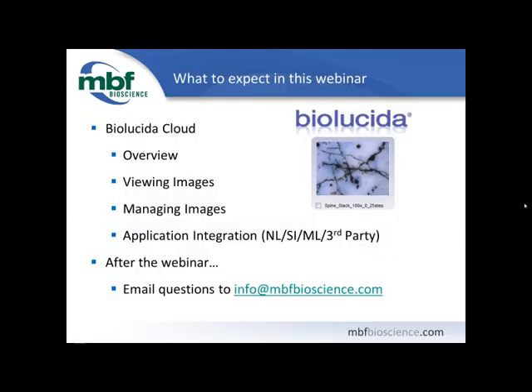The webinar will last approximately 60 minutes and is divided into these main topics. We will have an overview of the Biolucida Cloud, a description of how we use Biolucida Cloud for viewing images and managing images, as well as speaking on application integration with other MBF Bioscience products, like Neurolucida, Stereo Investigator, Microlucida, and as well as third-party software. The goal for today's webinar is to provide a practical demonstration of using the Biolucida Cloud image management system.